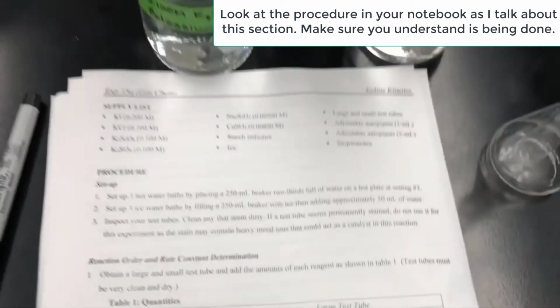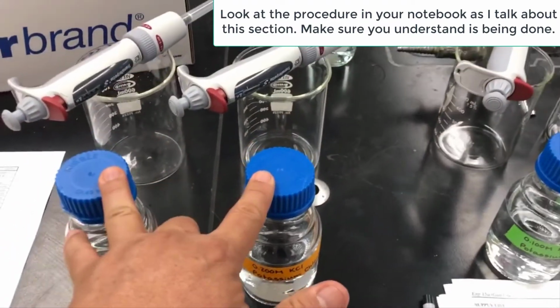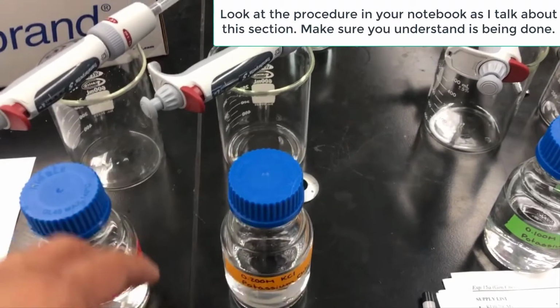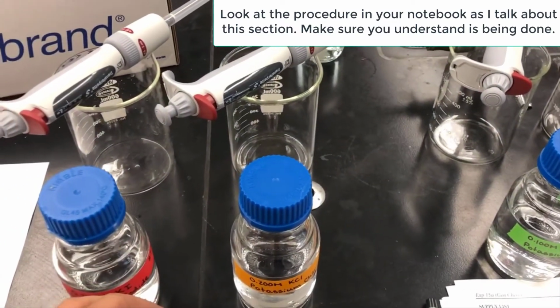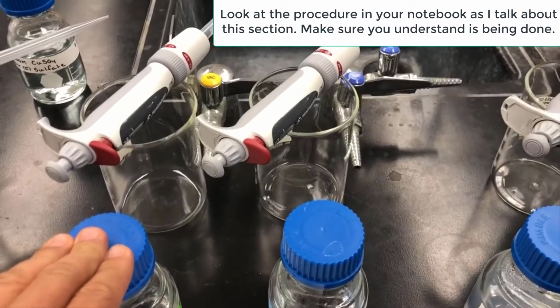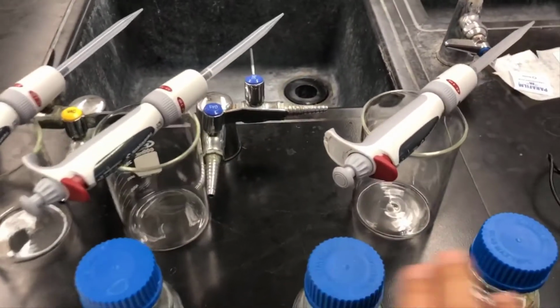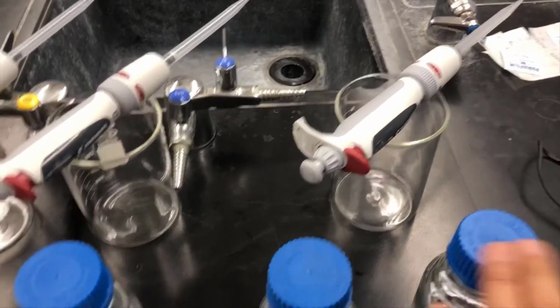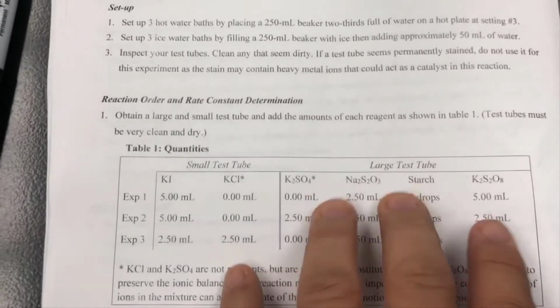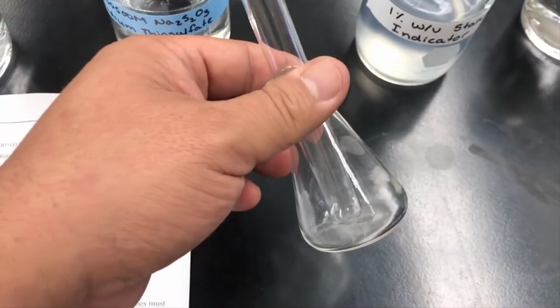So it's the same number of moles of thiosulfate in every experiment. Okay, so what I'm going to do is go ahead and take 5 mils of this and 0 of this. So basically it'll be 5 mils of KI in here. And then I'll do 0 mils of this. I'll do 2.5 mils of this, 2 drops of this, and 5 mils of this according to this table. Then that will be in this larger test tube.